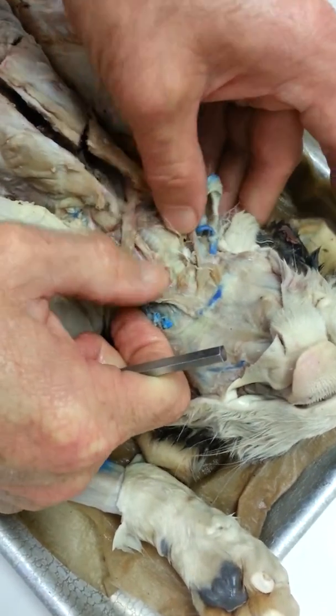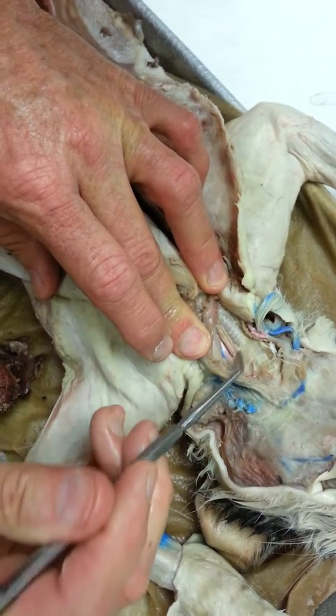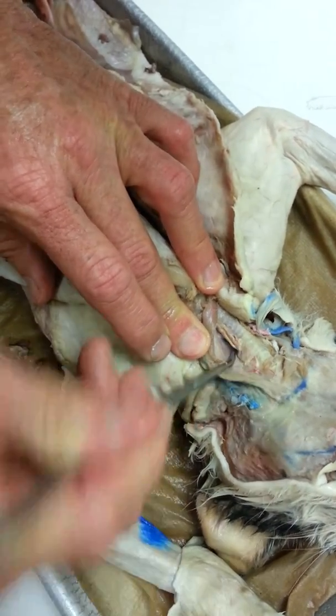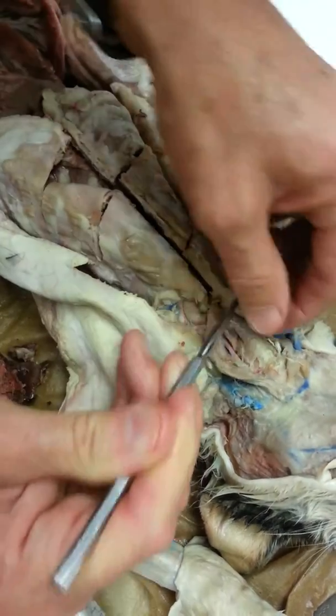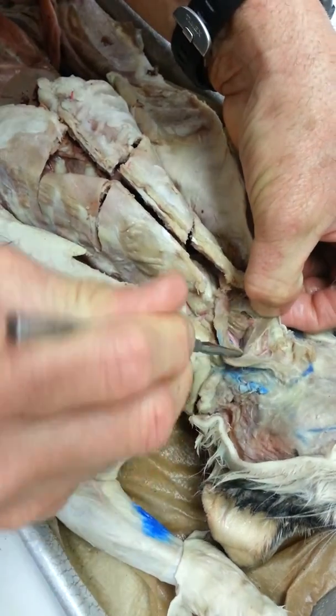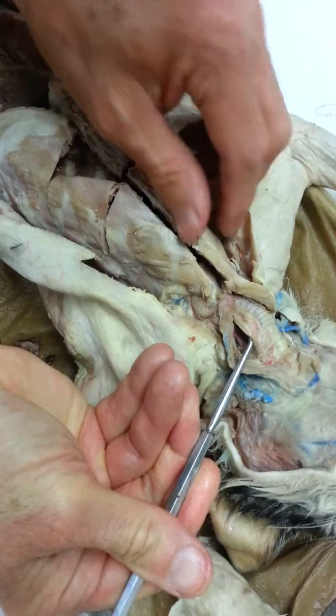And then if we go down to the neck area, this is the trachea with the ridges. This tube underneath, and I'll just stick this underneath, this is the esophagus right here. It's a tube-like structure. So what I'll do on the test, I'll put a probe underneath this like this. And that's the esophagus right here.